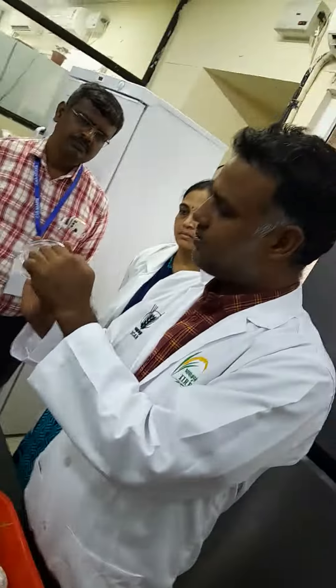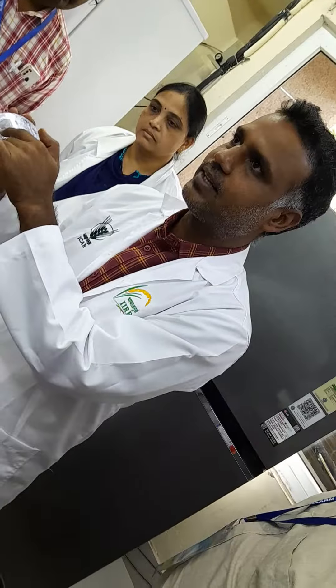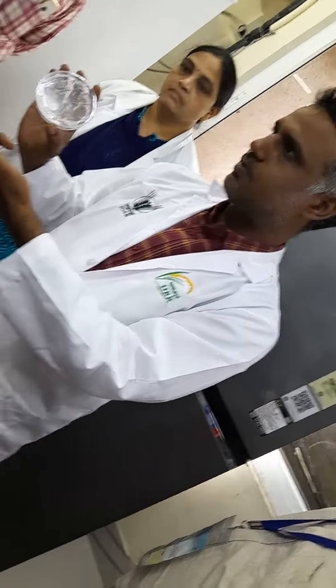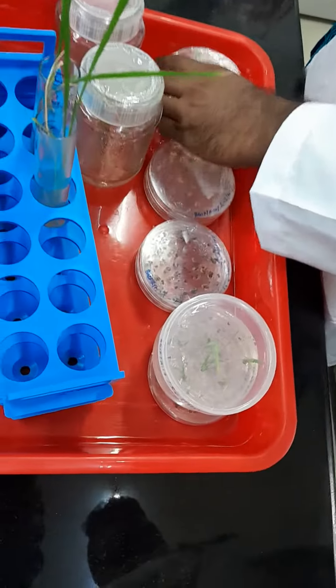To subculture this, we have to remove the extra root and the seeds, and take this callus and keep it in a fresh place. Or ideally you can go with a direct transformation. This is more than 20 days old. This is for presentation.